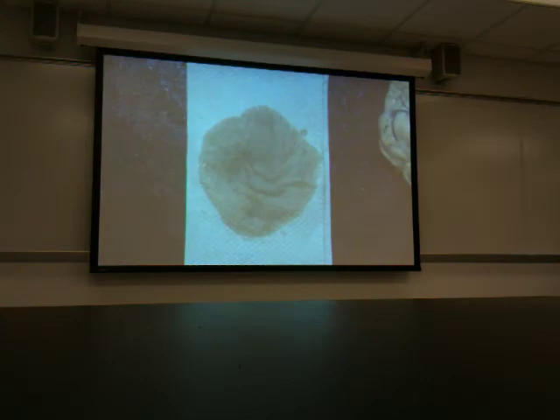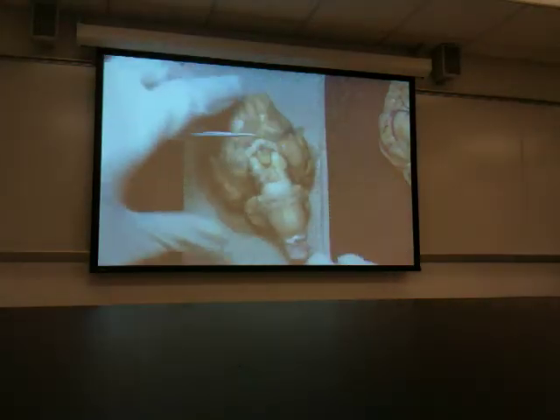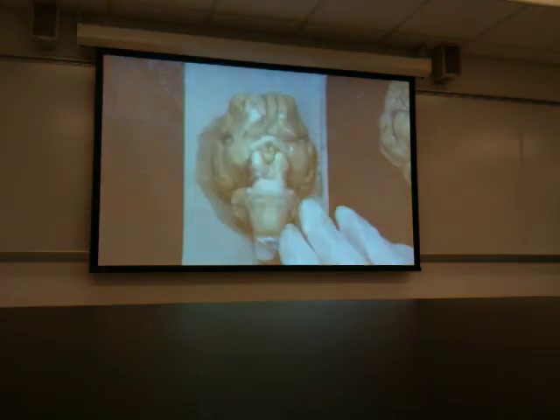Wait, can you just show us where trapezoid body is? Okay. But I have better ones for it. Oh, okay. So you might not test on this side, or just a different brain? The trapezoid body was not good on that one, and I will not test trapezoid body on that one. But it's real good on one of them that I have. Here's one that it's real good on, right here. Now here's your trapezoid body.